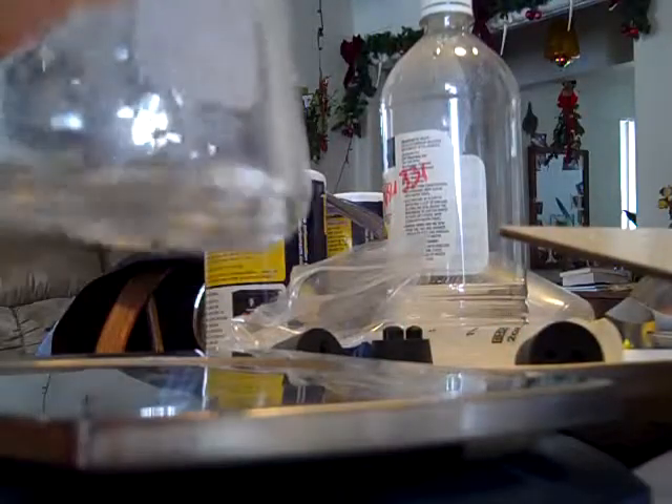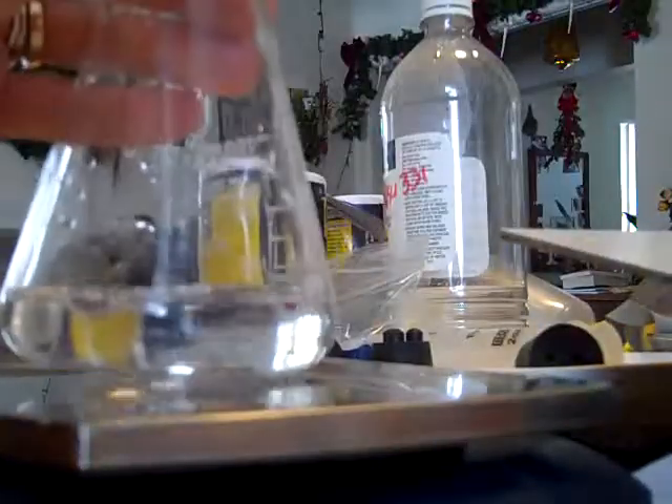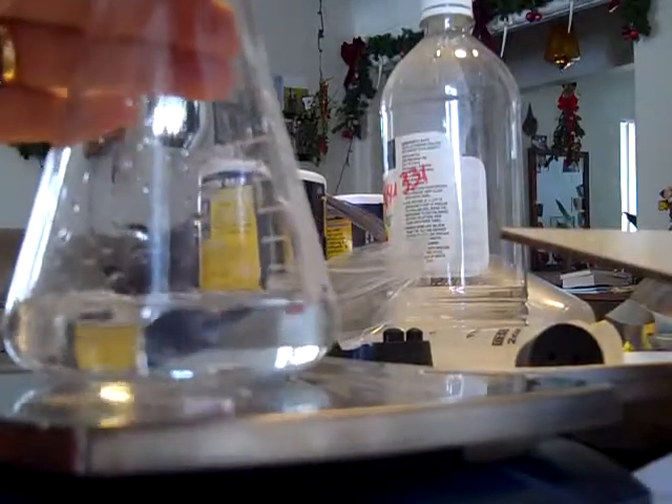Now we're going to put the two together. I am adding the Epsom salts to the ammonia and immediately stoppering the flask. Putting it on the scale — we have a mass of 201.1 grams.